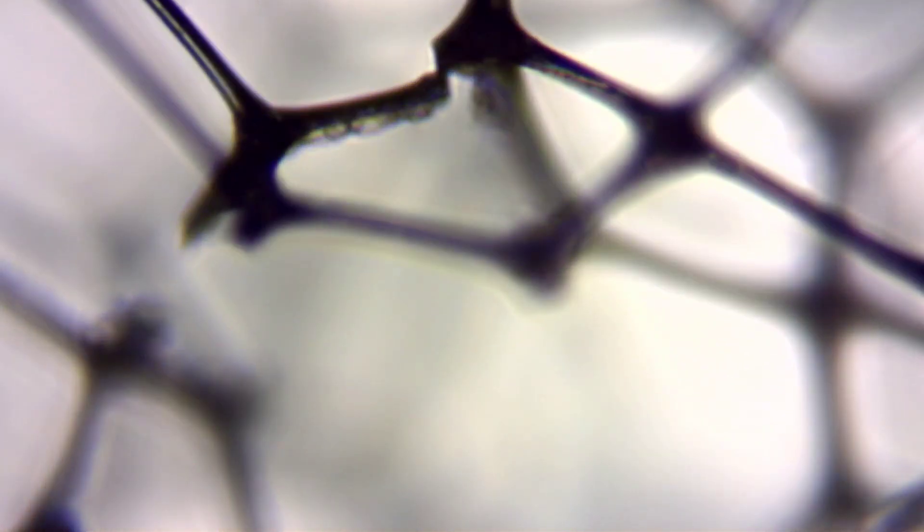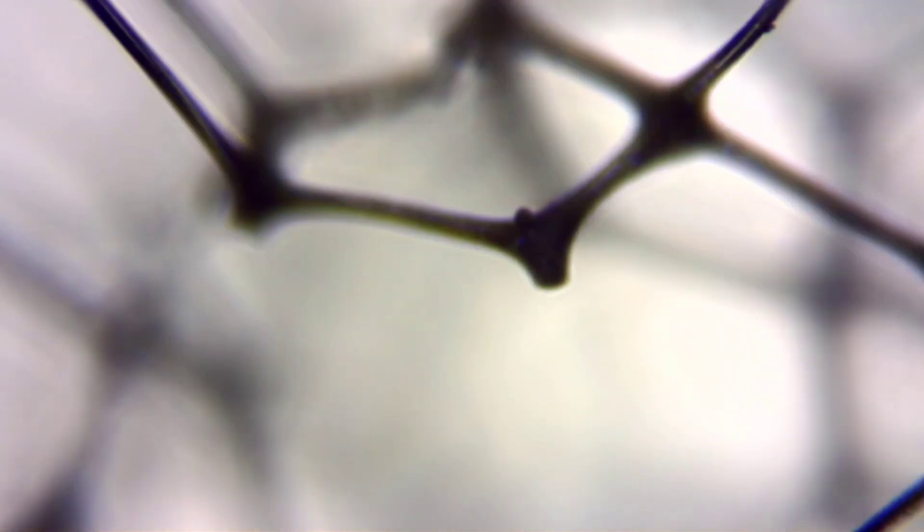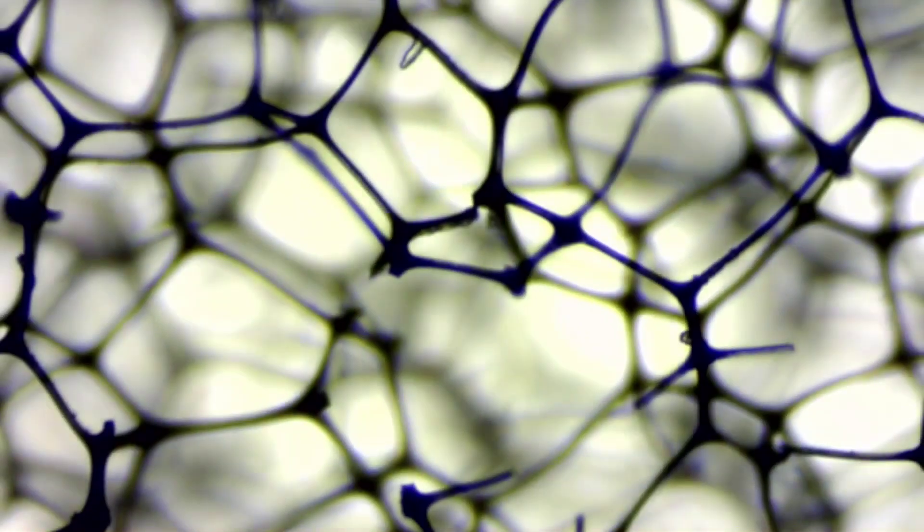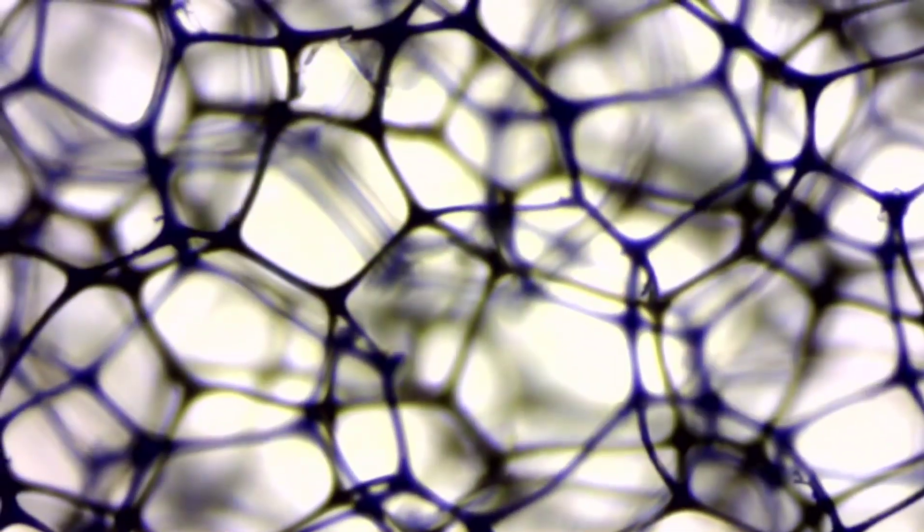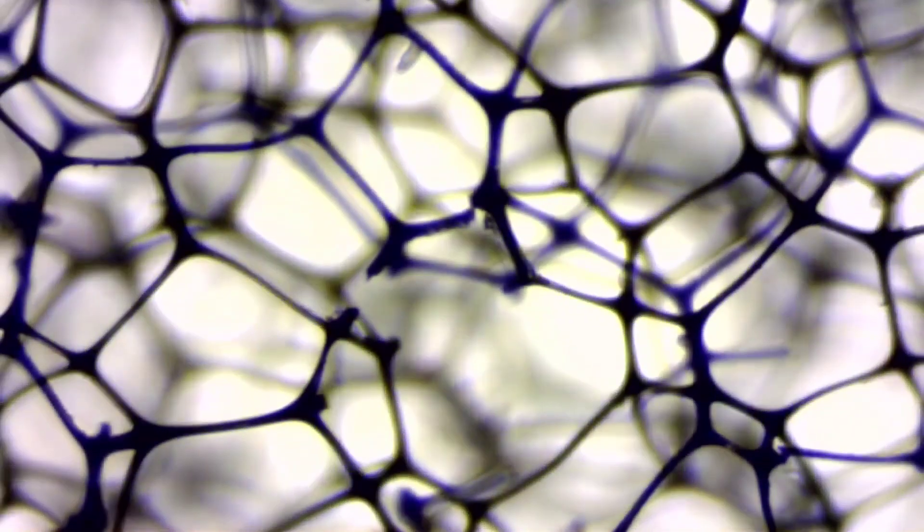Formaldehyde is what I hear they're made out of, so you can look up the Wikipedia on that to get a little more information. But there you go, that is the foam under the microscope.